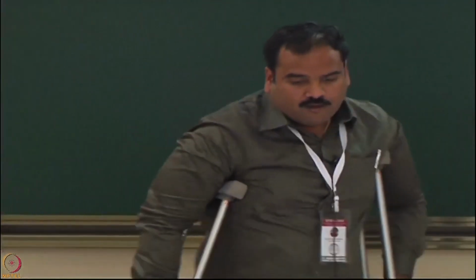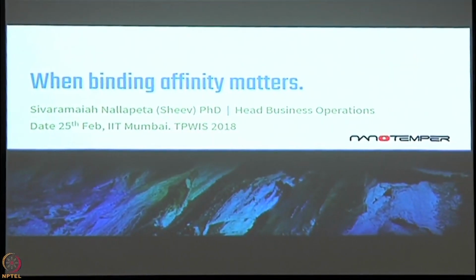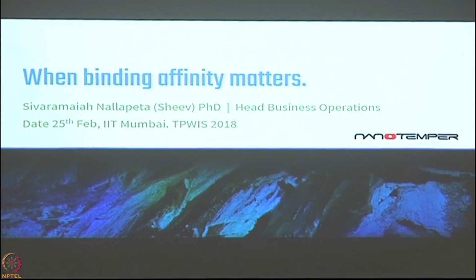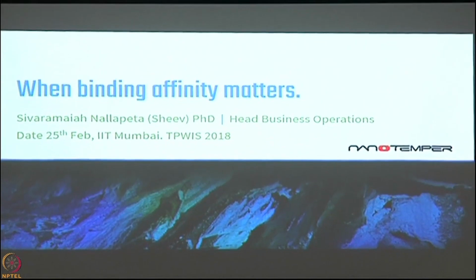Okay, great. So, this is a biophysical technique that determines the binding affinities. As I said, this is a technique about binding affinities, how you determine the binding affinity between two biomolecules. It can be anything, protein, small molecule, protein ligand, anything you can determine the binding affinity.